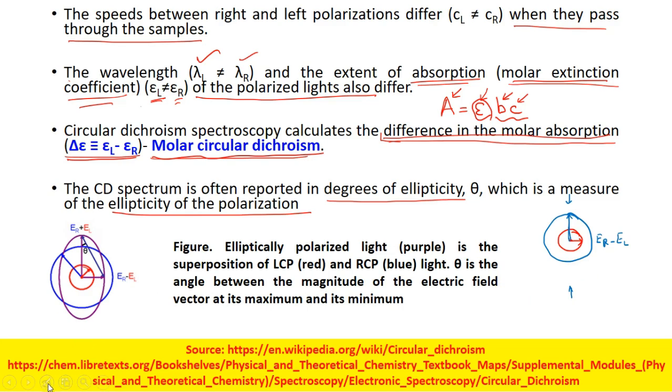So due to that, in this purple colored line you are having an addition component, and in this perpendicular direction there is a subtraction of the electrical fields.